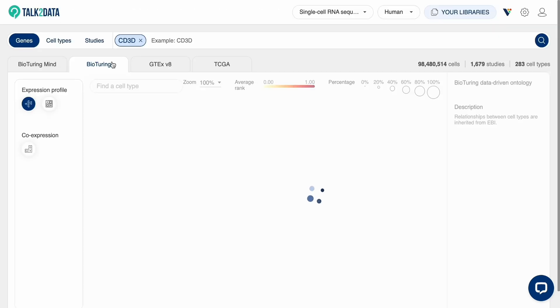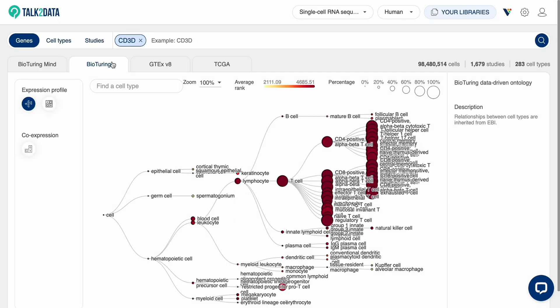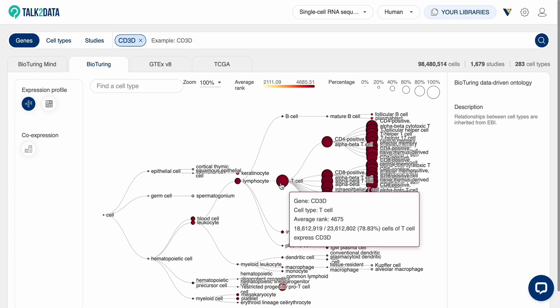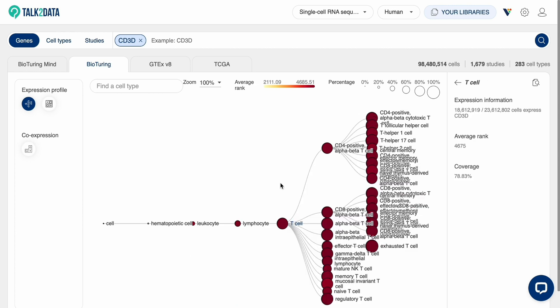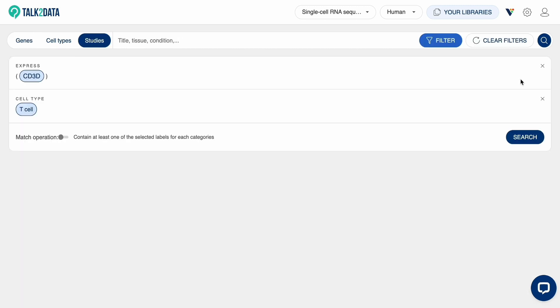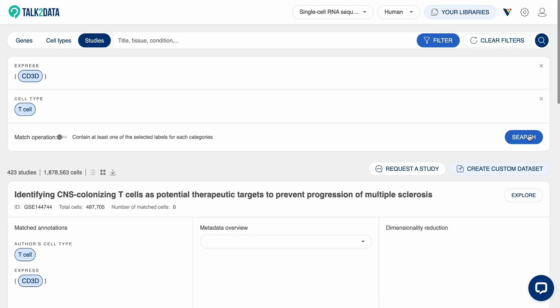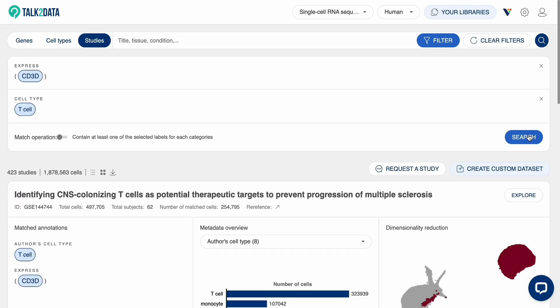An ontology tree will appear to display all the cell types expressing this gene. Click on the node to get a better view of the cells and their subtypes. Click on the Browse Studies icon to search for studies containing the selected cell with said expression.